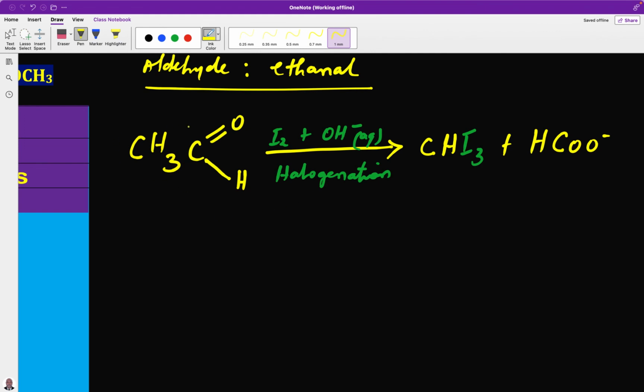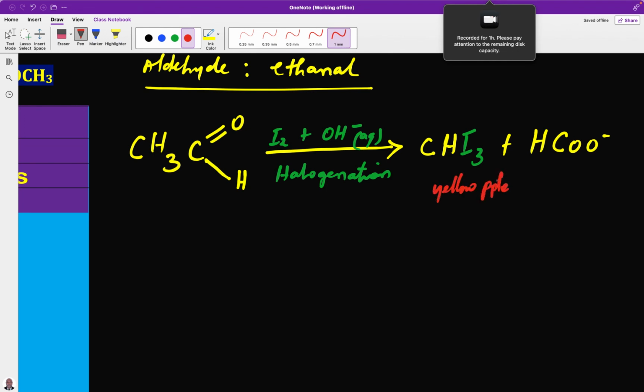So now, secondary alcohols are oxidized to what? To ketones. From the ketone, they were splitting. And now we did what we call alkaline hydrolysis. So there is first halogenation, followed by alkaline hydrolysis. When we did the halogenation, the hydrogen atoms were replaced by the iodine. Secondly, hydrolysis. That is why you see the hydrogen here and the extra oxygen on this other side. So now, this is what we call a yellow precipitate of triiodomethane.